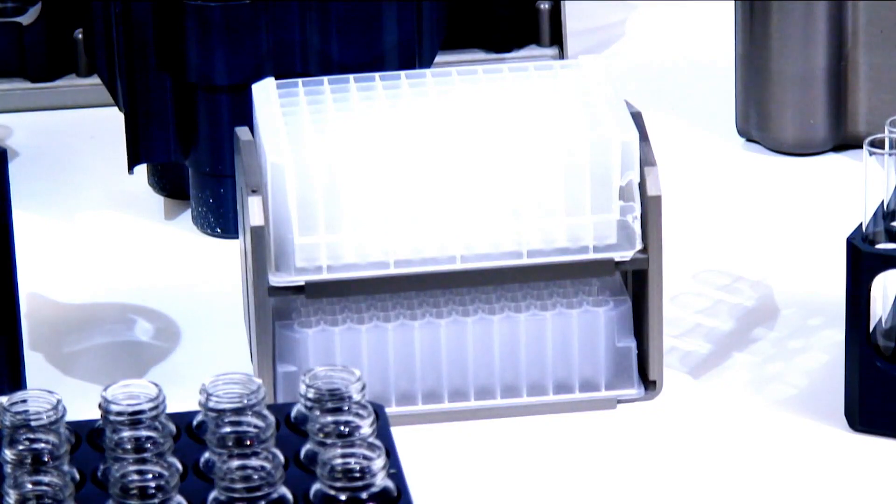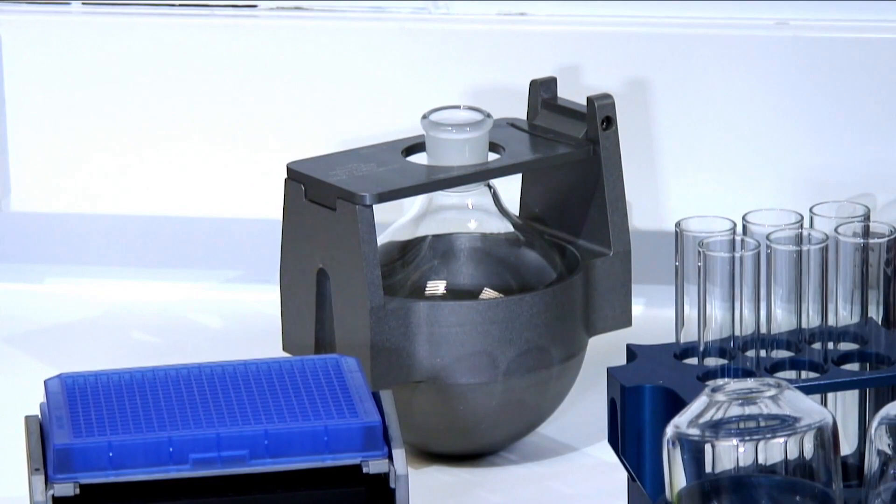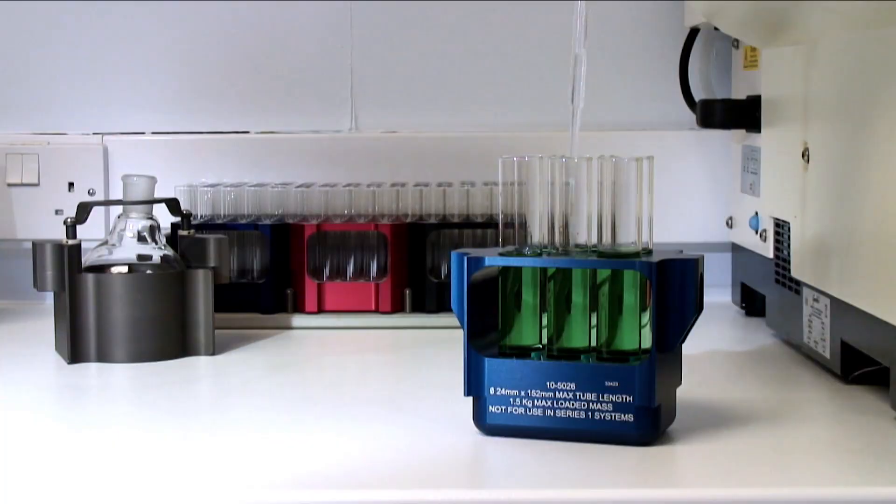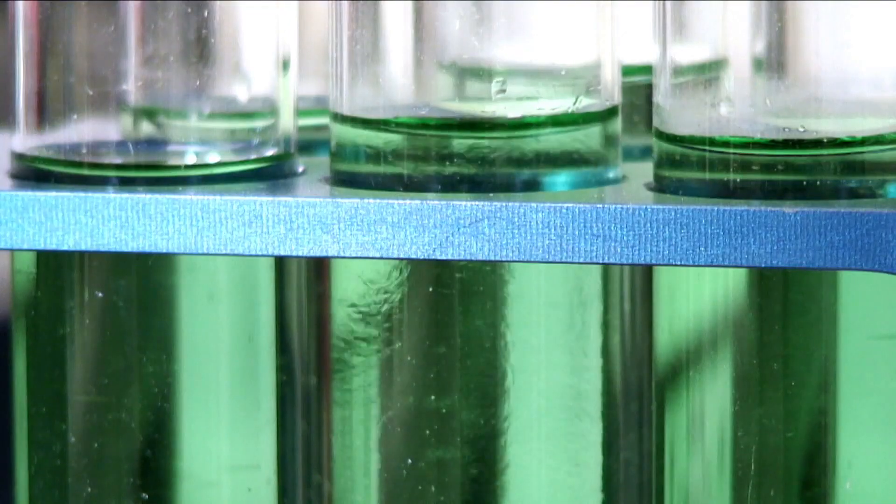If you need to concentrate rather than dry your samples, then the standard methods can be optimized by your local Genovac representative.